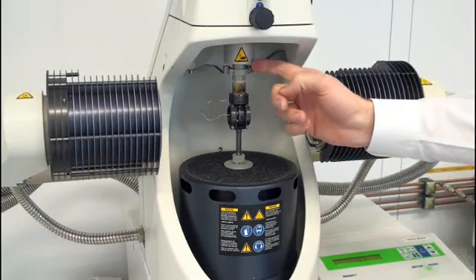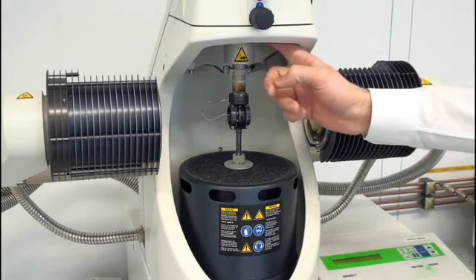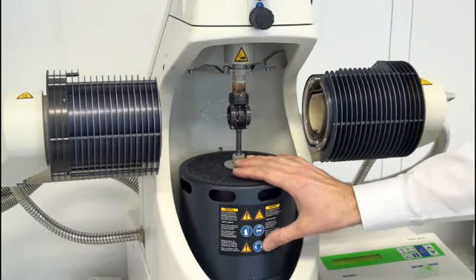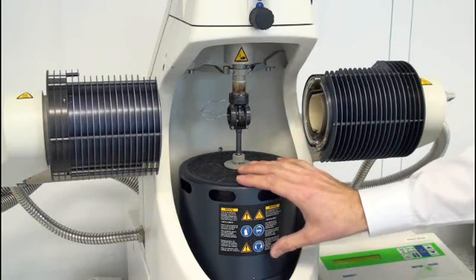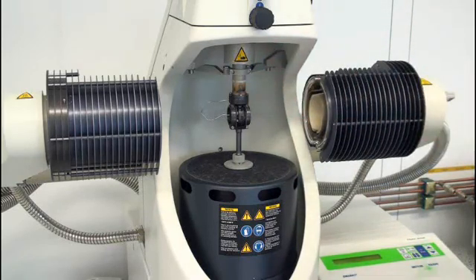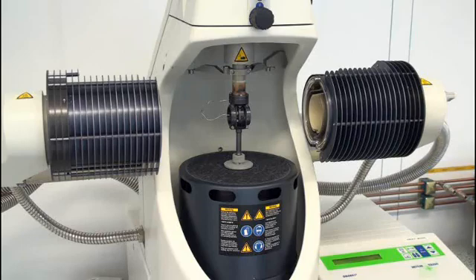Up here we have the sensors to measure the force and the displacement. Down here is the motor to generate the force. You see the force generation and the force measurement are independent. This is important when it comes to calibration. And last but not least, here we have the thermocouple which measures the sample temperature. These are the key elements needed for accurate DMA measurements.